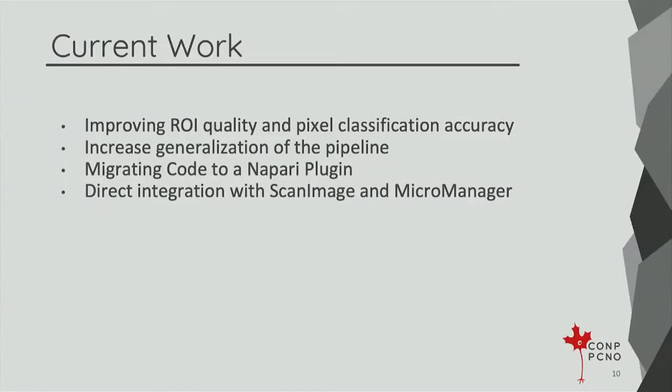I'm migrating the code to a Napari plugin to make it a little bit more user-friendly with a user interface based off of that environment. And then we're providing direct integration with ScanImage and Micro-Manager, so the ROIs generated can be fed directly into microscope control software.